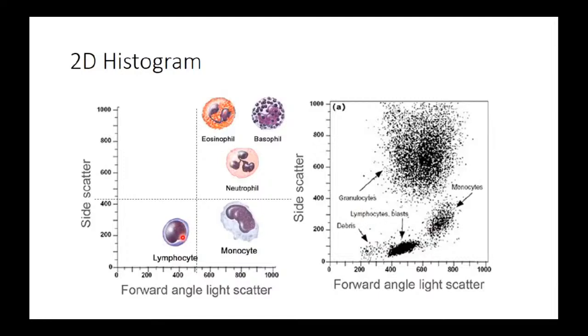Of course, this is a very useful technique used to count the cells and to analyze the phenotype and the health situation of the cells. And what's very special about this technique is that we can analyze many thousands of particles and cells per second. It's an easy technique. It's not very hard to perform, and it's precise. It's very used nowadays in all the laboratories.